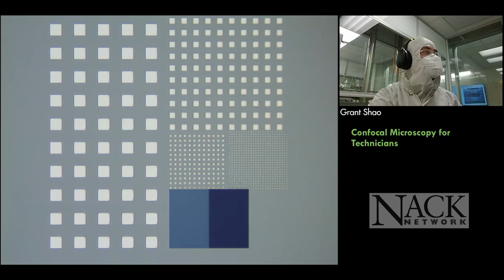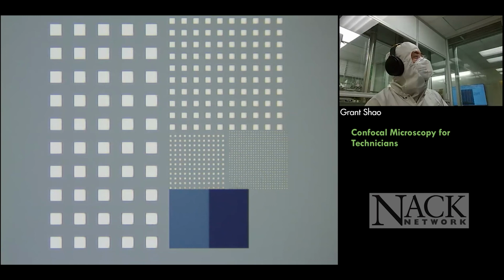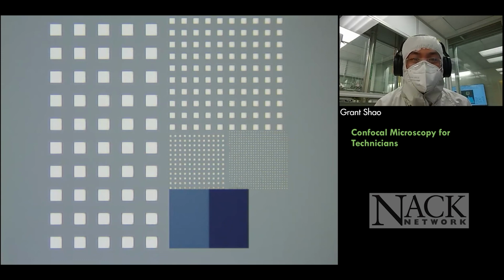Even with the acoustics, sometimes when you take the scan, you'll see the wavelength show up in the scan. And one other question about sample types. Fatma and I showed biological samples that were either dyed or autofluoresced. Have you encountered samples that this imaging technique isn't good for, like a particular type of material that you try to use this microscope for, and it doesn't really work? I would say for most applications, it'll probably work. I've seen things like rock samples, films, gels.